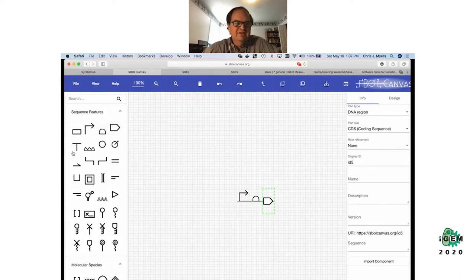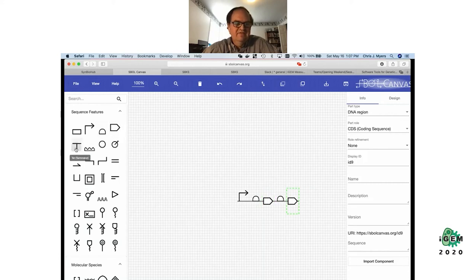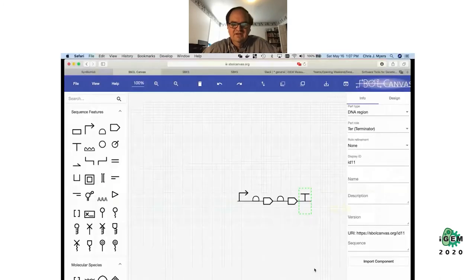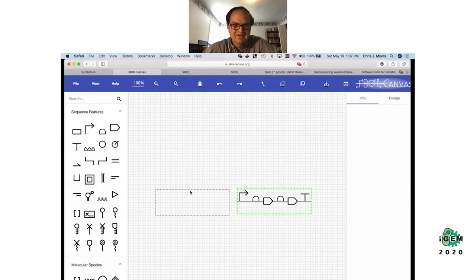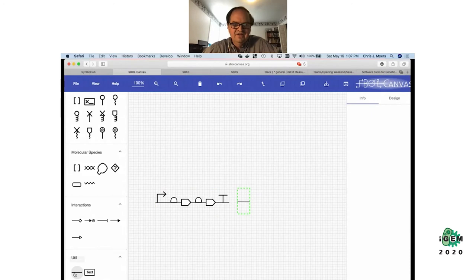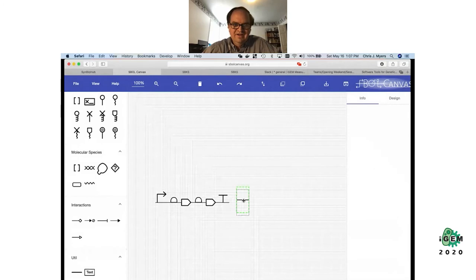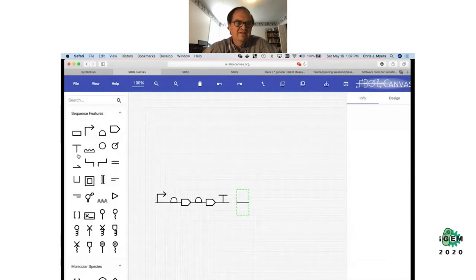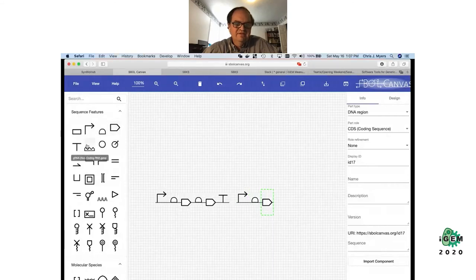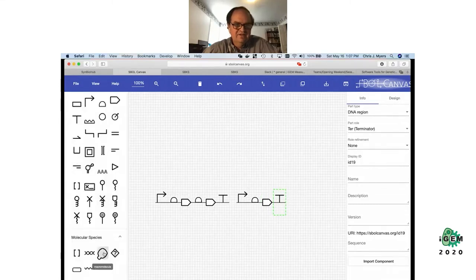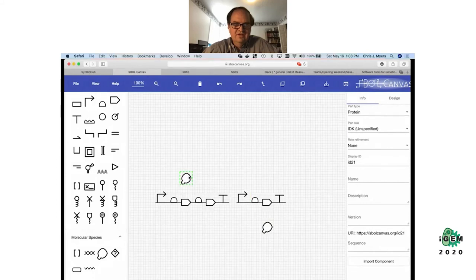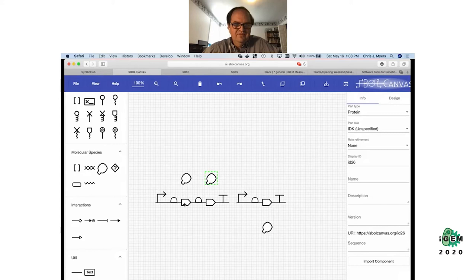I'm building up my genetic design. This first circuit has two coding sequences — I'm also building another transcriptional unit for the other part. Then I want to indicate that there are a couple of interesting proteins, and for good measure I'll put in GFP as well. I then indicate that this coding sequence codes for this protein by adding an edge.